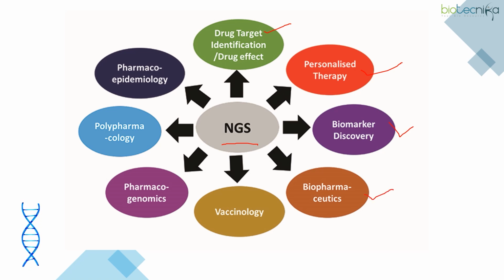And this technique is even playing a very significant role in virological study, because overall sequence analysis based on fragment generation and then genome alignment with respect to the reference genomes can be done, so that we will get to know the similarity and even the evolutionary information about the targets, right? So that's why the virological study or the pharmacogenomics approach is also included with NGS.